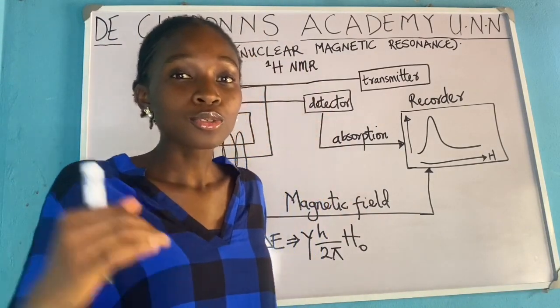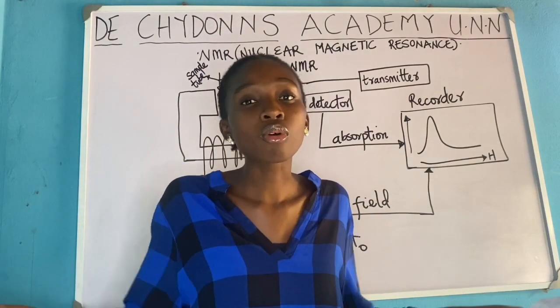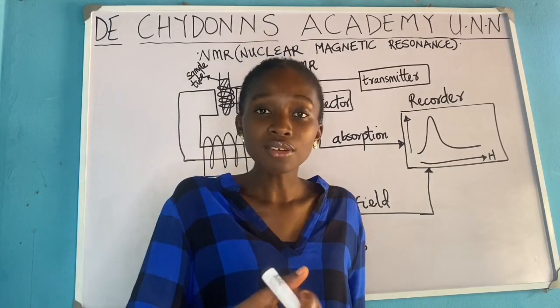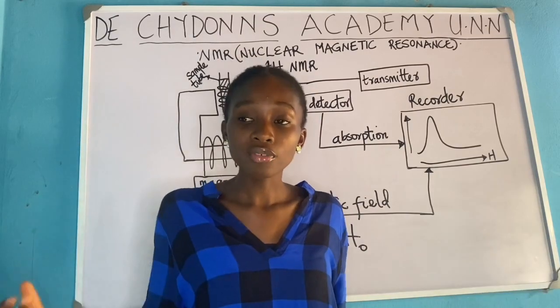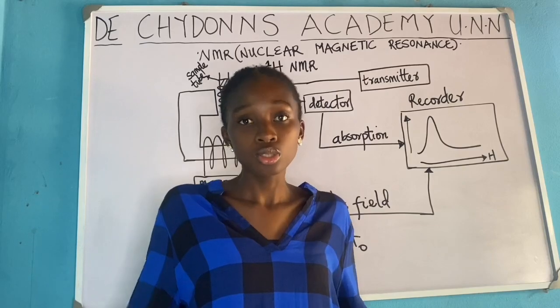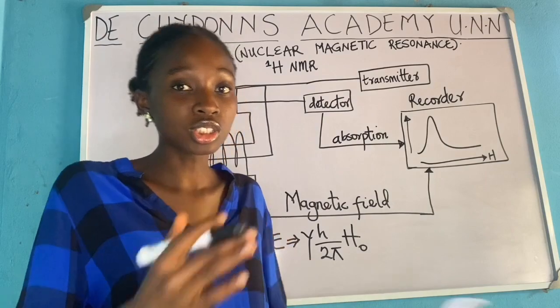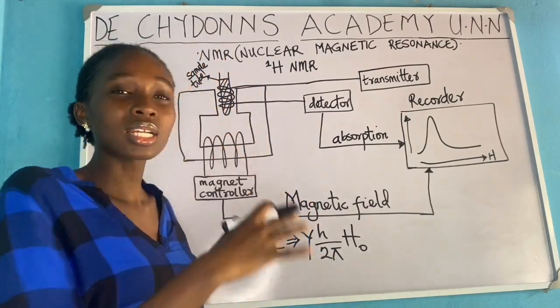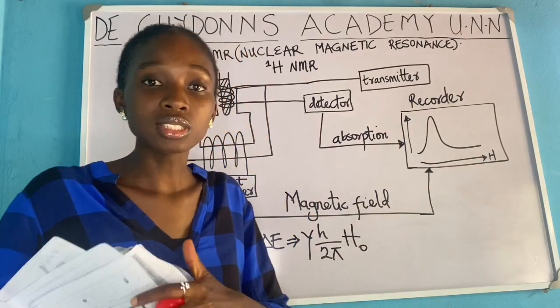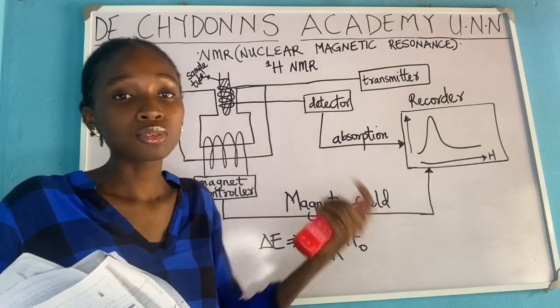So what do you now use? Those fields. If there are a lot of electrons, your electrons will do the work of covering the nucleus very well. But if there are few electrons, it will be easier for you to get to the nucleus. So a lot of electrons shield the nucleus, and very few electrons shield it less. Based on the particular structure of that compound, there are a lot of factors that can shield or deshield the nucleus. Based on that structure, you can decipher where it will peak in the record at the end of the day. But usually, apart from your sample, there's something else you have to add.